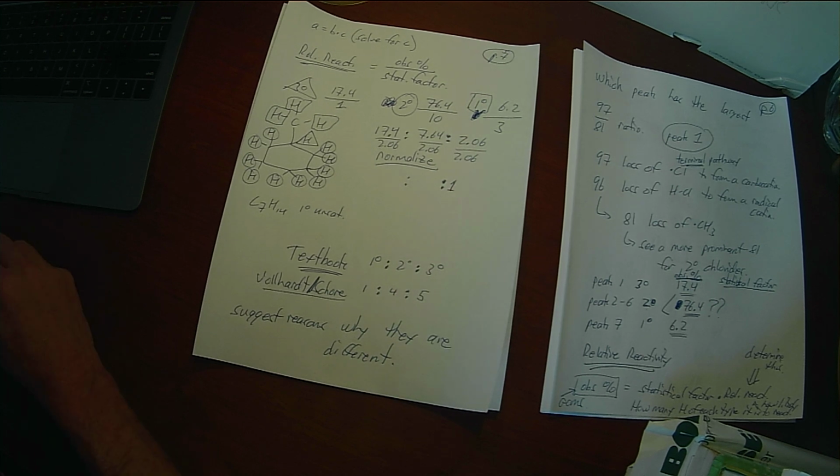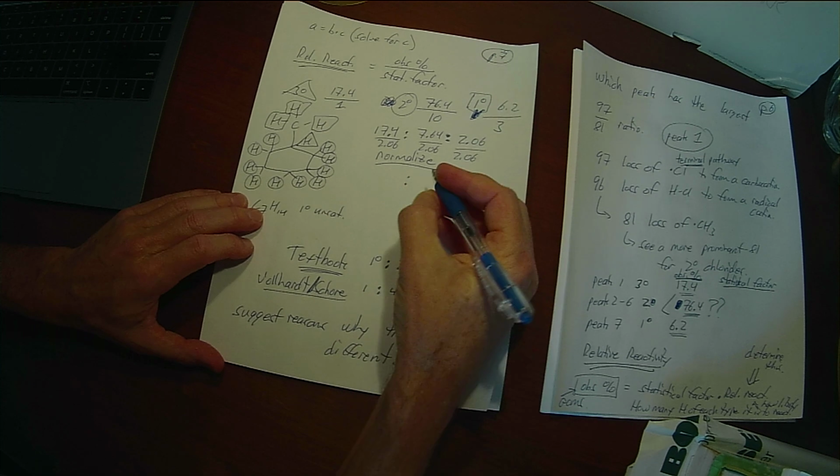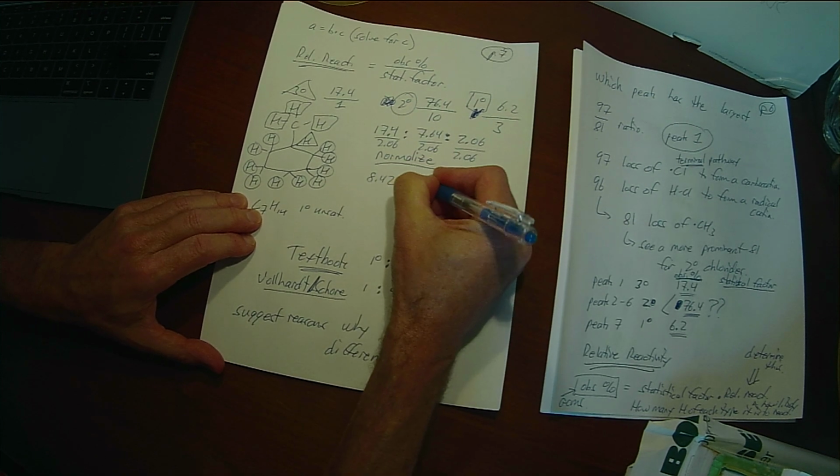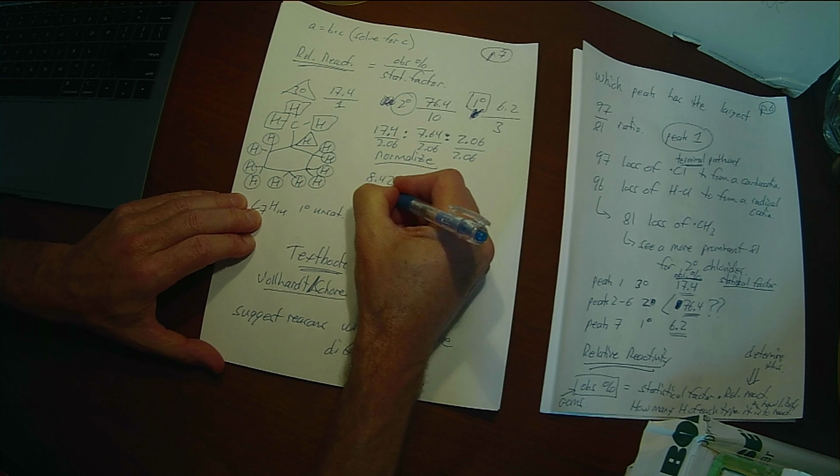Okay. So when you write your lab report, which is going to be due after break, you are going to want to go through a little bit of this reasoning process. You'll want to explain how you identified which peak was which in the GC mass spec. It would be appropriate to have that table of retention times. So we got 8.42 here, and we got 3.69 there for secondary.